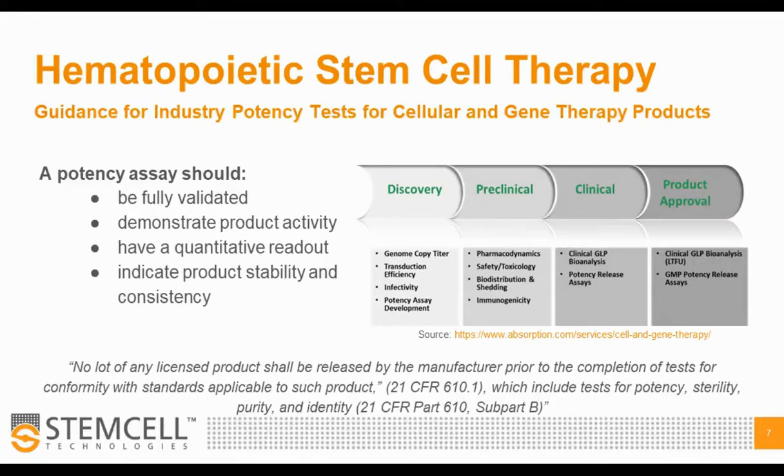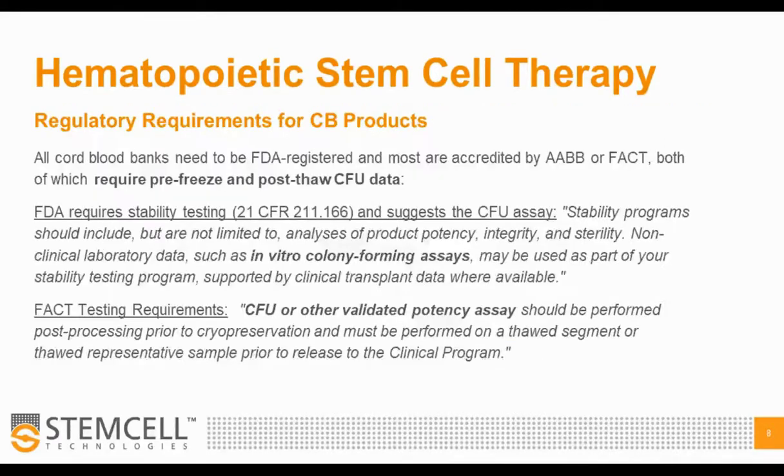Normally, these start, as you can see, at the beginning of the discovery phase when you're developing a therapy. Potency assays are really at the developmental stage there. And then as you go through your clinical trials, the more assays that you have that describe the potency of the product, the more able you are to find one or two that very specifically correlate with good clinical outcome.